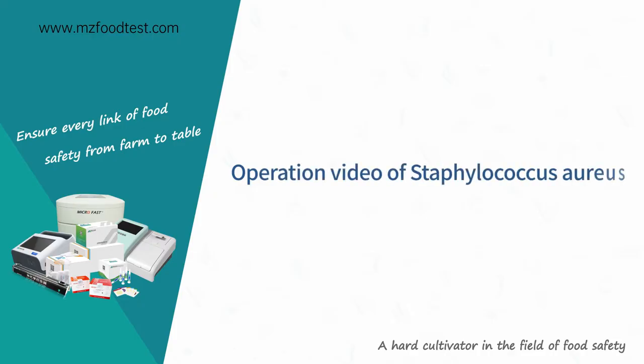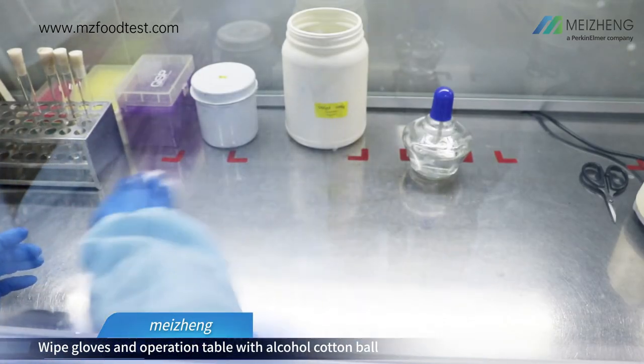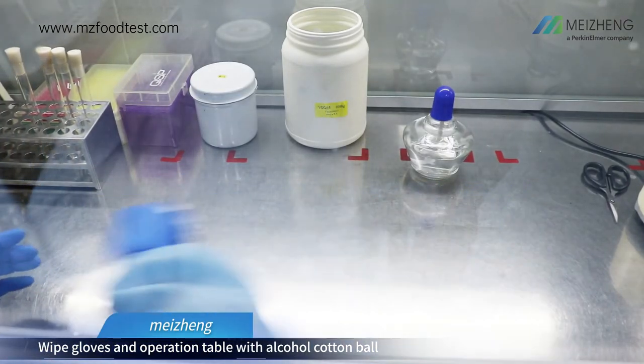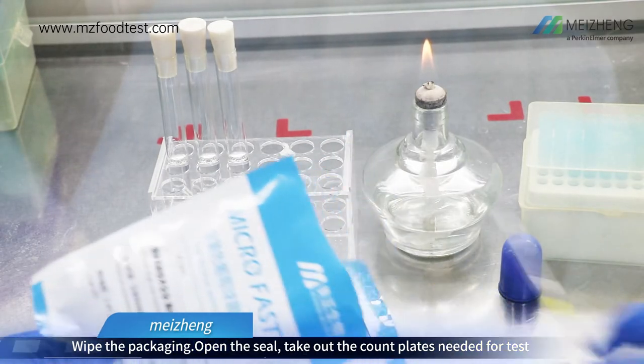Operation video of Staphylococcus aureus. Wear lab coat, mask and gloves. Wipe gloves and operation table with alcohol cotton ball. Light the alcohol burner. Wipe the packaging.